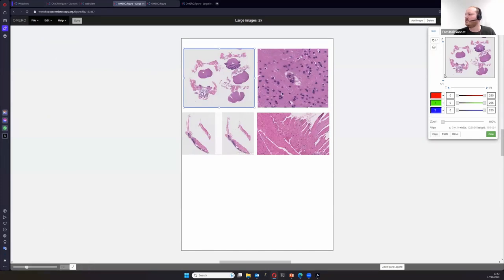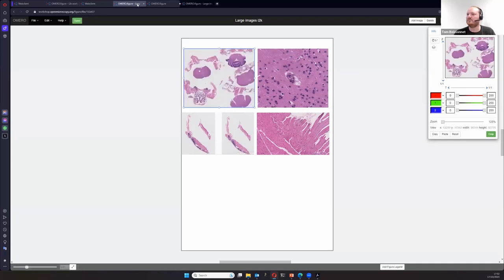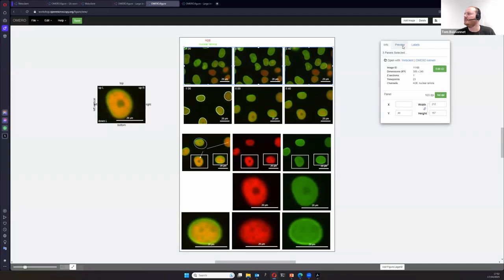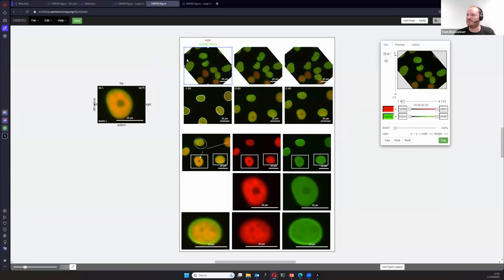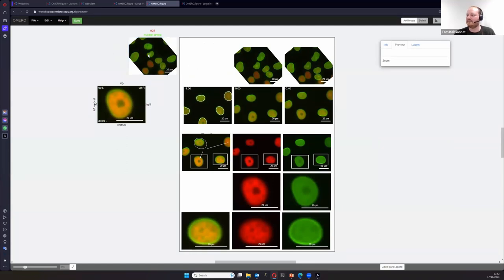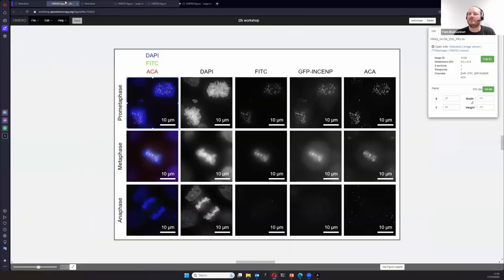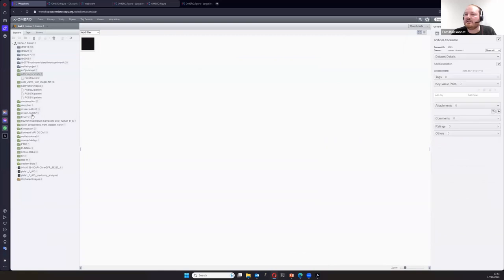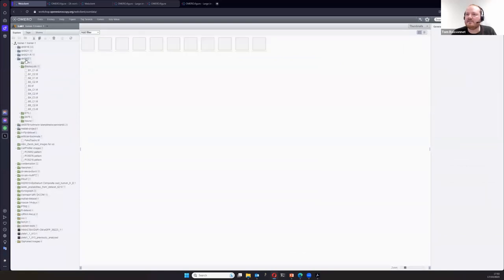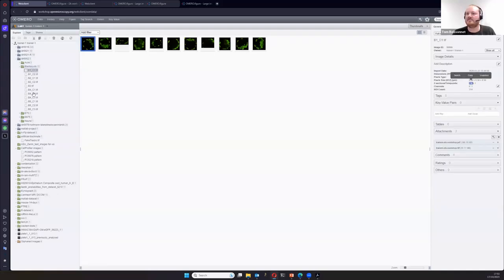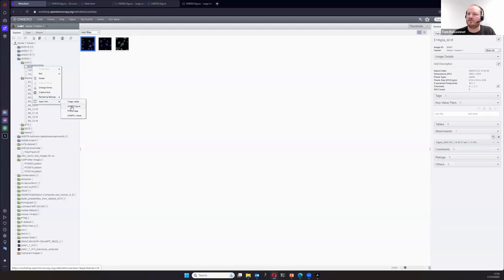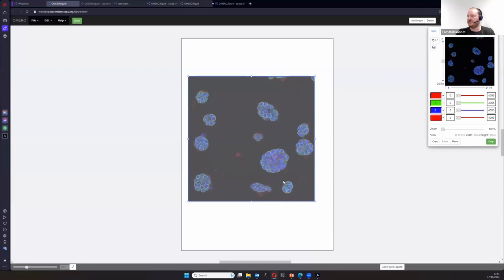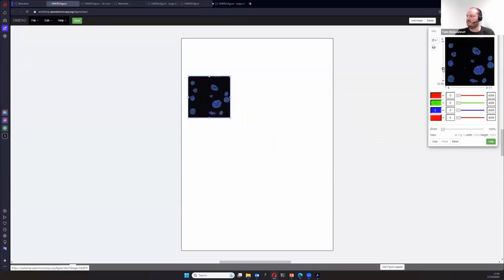We can also play with the rotation of the image, though this is not very common — if you rotate your image in the square canvas, you'll have some effects on the edges. Another thing we could do: let's open this dataset with OMERO Figure — we now have a stack. This image is a stack, so I can scroll through it, and I could also do a maximum intensity projection here.